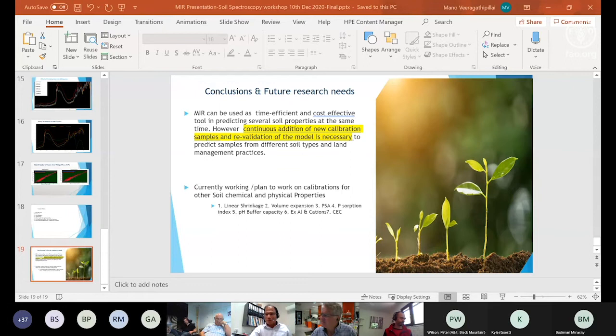Look, after both Manu's and Buddy's talk, there's probably not that much I need to say because you both introduced CSIRO's long history of work in this space and also my personal interest in the carbon fraction predictions in particular. Thanks, Manu. But I just want to acknowledge first and foremost that CSIRO has quite a lot of expertise in MIR and NIR analysis of both soils and other geological samples as well. And it's spread across a range of domains. I think Ian Lau's on the line, who comes from minerals. And then I think Sean's going to talk about Ziltec and perhaps what they've been doing with Mike McLaughlin, et cetera, from Land and Water. But within agriculture, there's myself and Lynn McDonald based at the Waite campus, and Uta, who will talk very soon, and Brendan, who's already been mentioned, and Peter Wilson and Sanani Karaniratni and Saya and others based at Black Mountain. So quite a lot of us working on soil analysis.